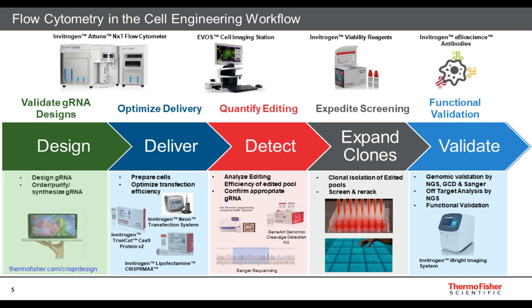So let's take a little more of a deep dive and look at the gene editing and cell engineering workflow. There are a lot of different reasons to do gene editing and a lot of different experimental endpoints, but most gene editing experiments will follow this basic workflow, which is to design, deliver, detect, expand your clones, and validate. So during the design process, you design your guide RNAs, order, purify, or synthesize these guide RNAs. And then the next step would be to deliver.